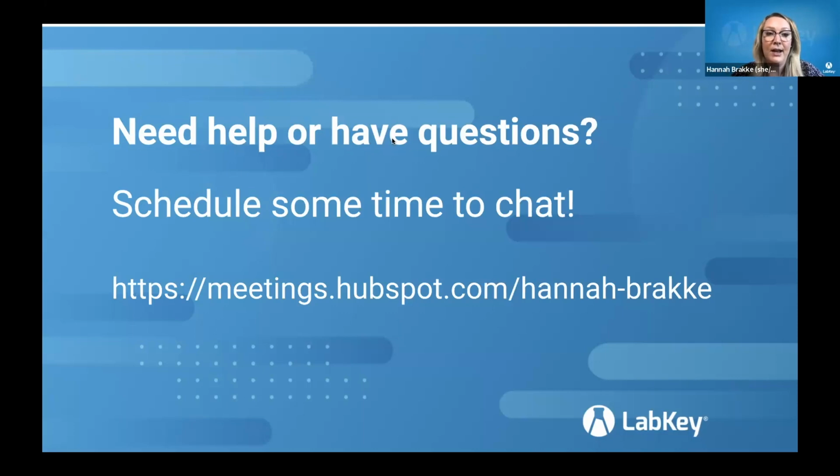We have a very knowledgeable team that has compliance backgrounds in terms of being able to manage this data. We also have additional security when PHI comes into play, or when there are additional requirements around trying to meet HIPAA. If that is something that's needed, we're certainly capable of doing that, and can offer that to our clients as well.